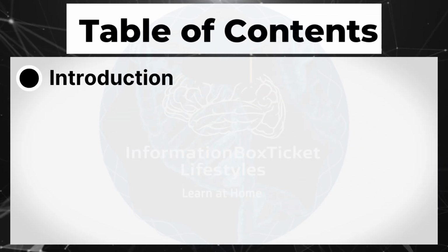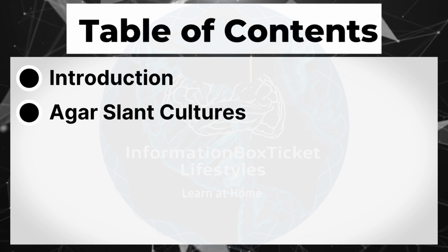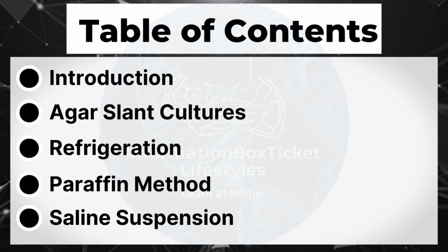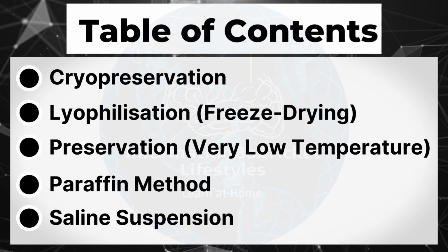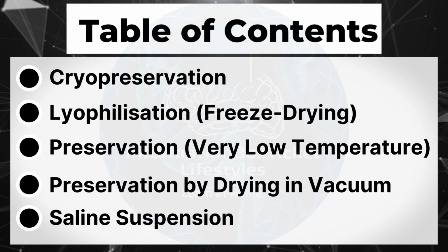Table of contents. Introduction to bacterial and fungal preservation methods. Agar slant cultures. Refrigeration. Paraffin method. Saline suspension. Cryopreservation. Lyophilisation, freeze drying. Preservation at very low temperature. Preservation by drying in vacuum.